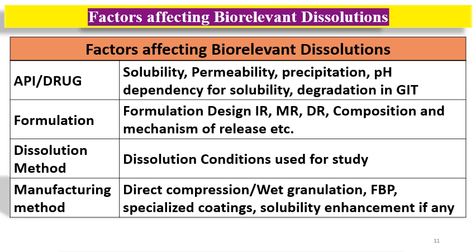Then manufacturing method, whether you are making your product with direct compression, wet granulation, fluid bed processing, whether you are using a specialized coating or you are using a solubility enhancement, if any. So whatever the manufacturing method is there or solubility enhancement technique is there or you are using a higher polymer content, all these factors will impact the dissolution.